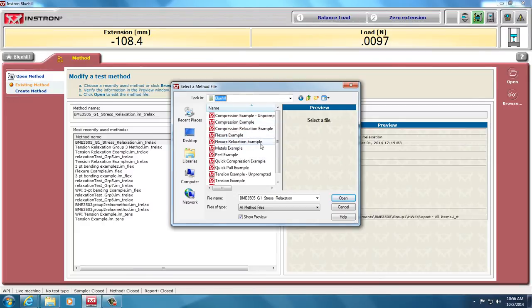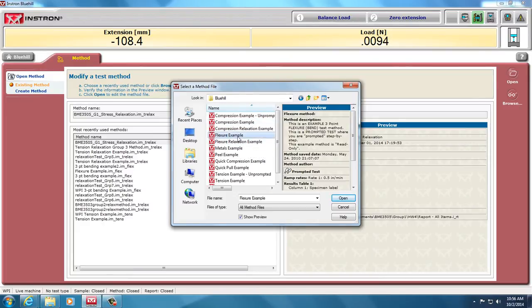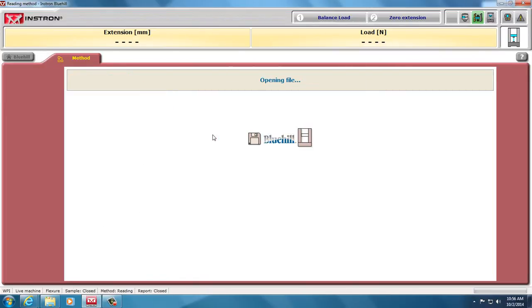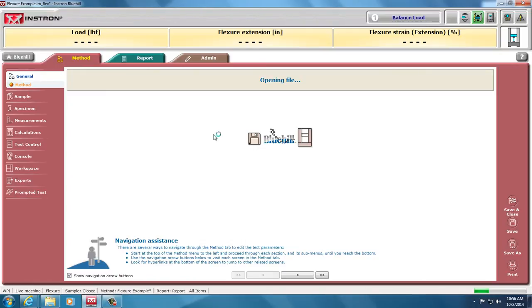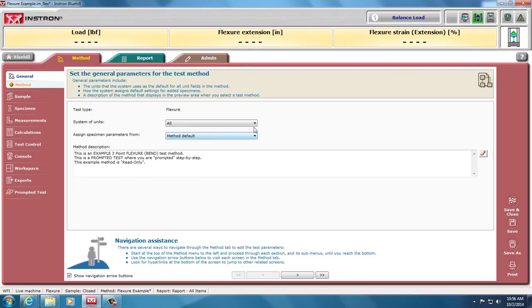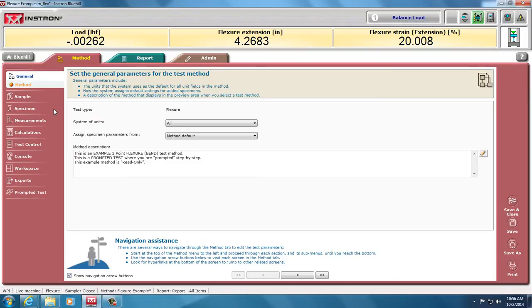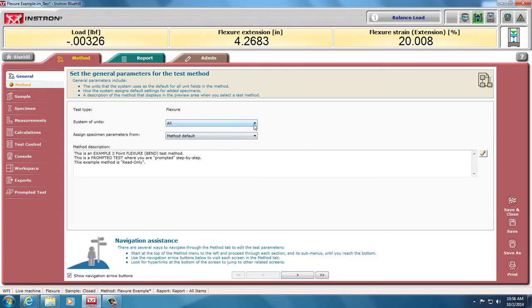One is a flexure relaxation example, but we want a regular flexure example. Here, as with other types of tests, you have your workspace on the left here, but with BlueHill 3, we have navigation assistance to walk you through it. I'll be using the ones on the left here.